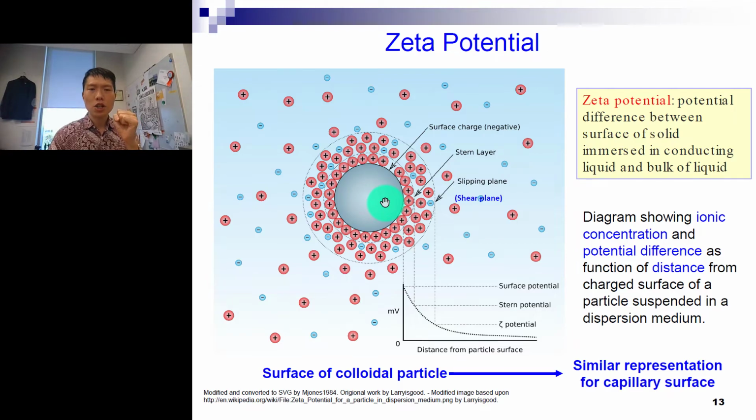So as we covered, this is a charged ion. This is not the O minus. It's just, let's say, a chloride ion, a chloride suspended inside the capillary, highly charged Cl minus. Now there are some positive cations, let's just say sodium. Ignore the size for a while. Because of that Coulombic attraction, you have all the cations surrounding this anion. Because of the electrostatic attractions here, the first layer becomes very permanent. So we call this the Stern layer.